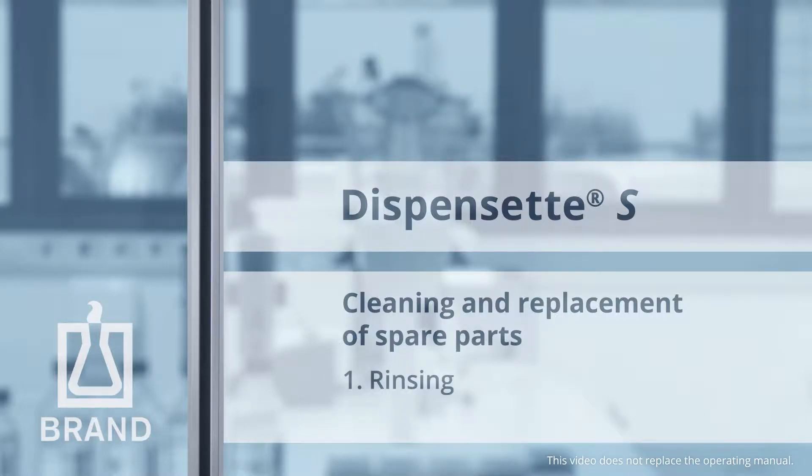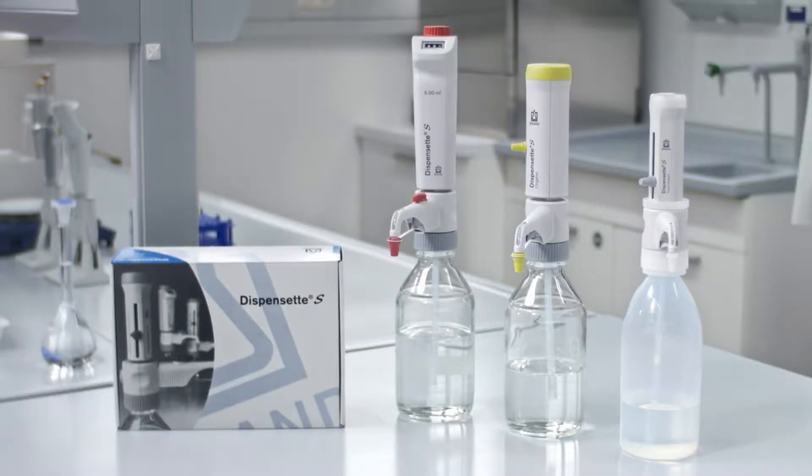In this video, we will show you how to disassemble and clean your Dispenset S and how to replace spare parts. Your Dispenset S is designed for precise and effortless operation. To ensure optimal performance, even after long-term use, regular cleaning is important.